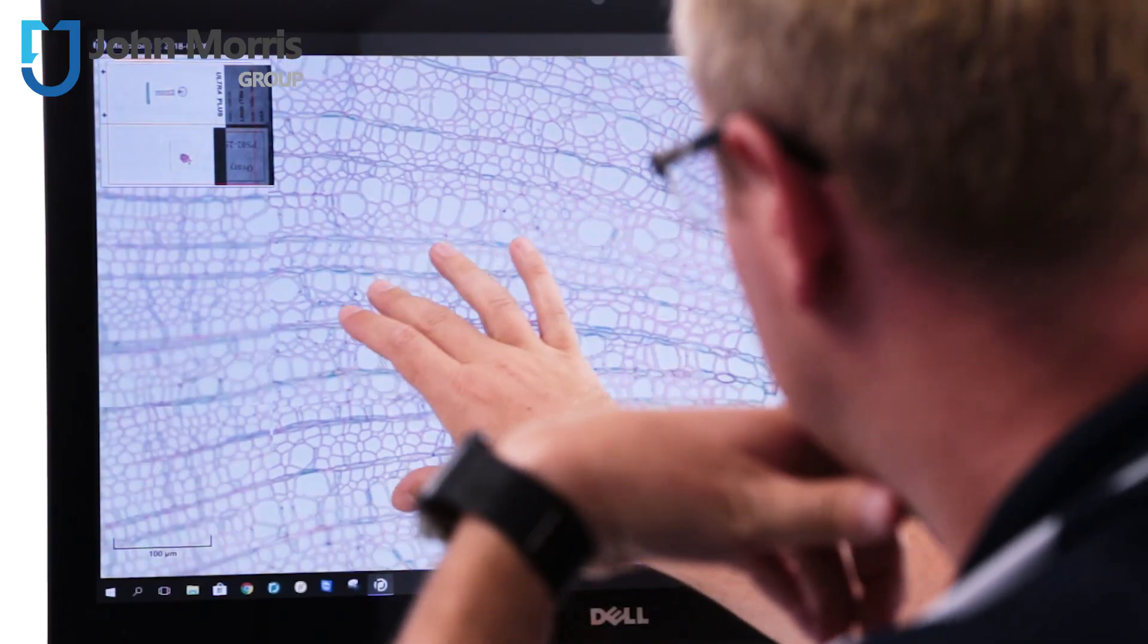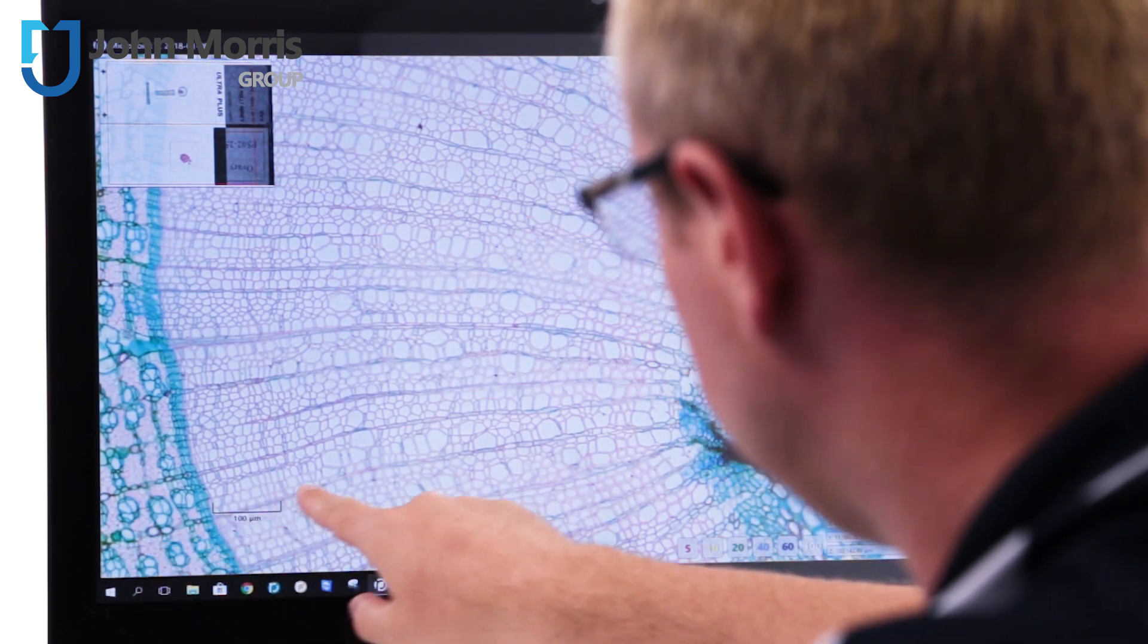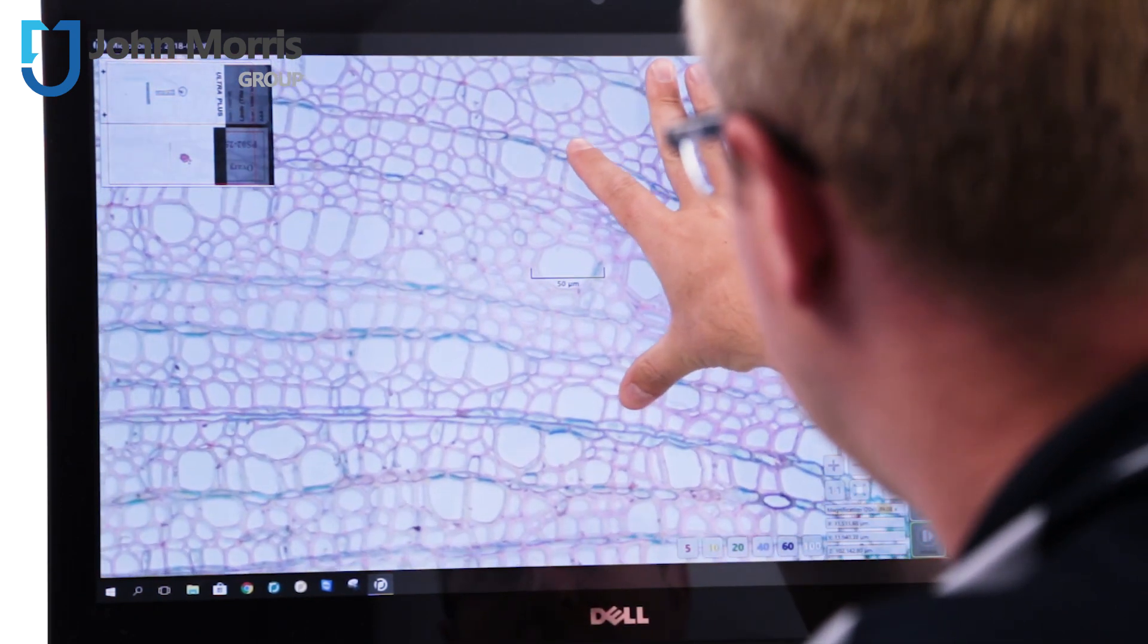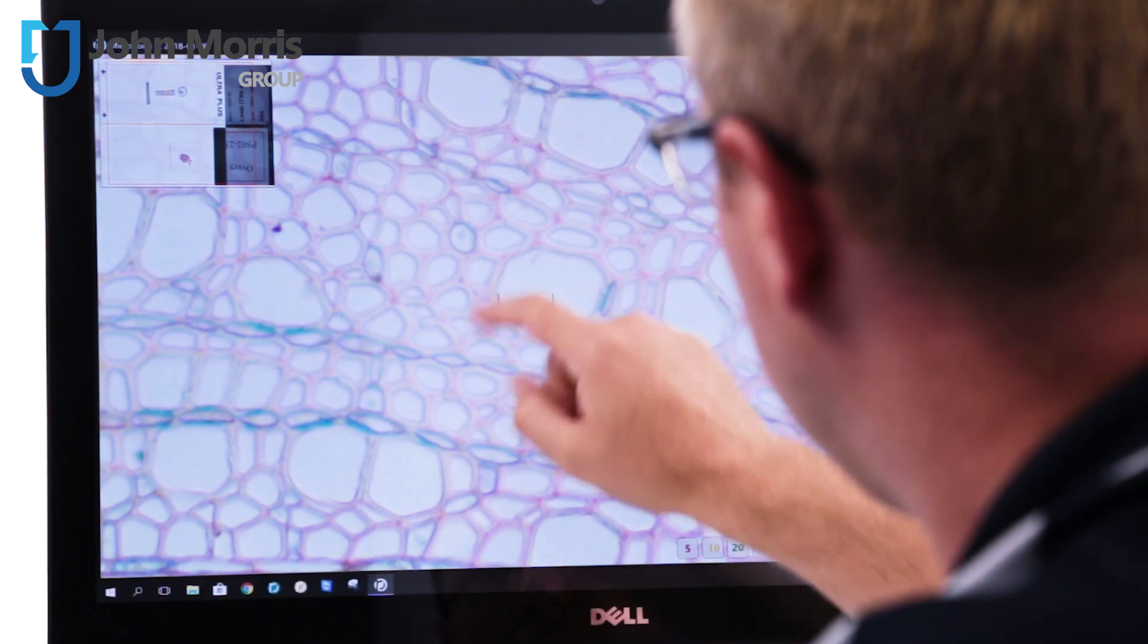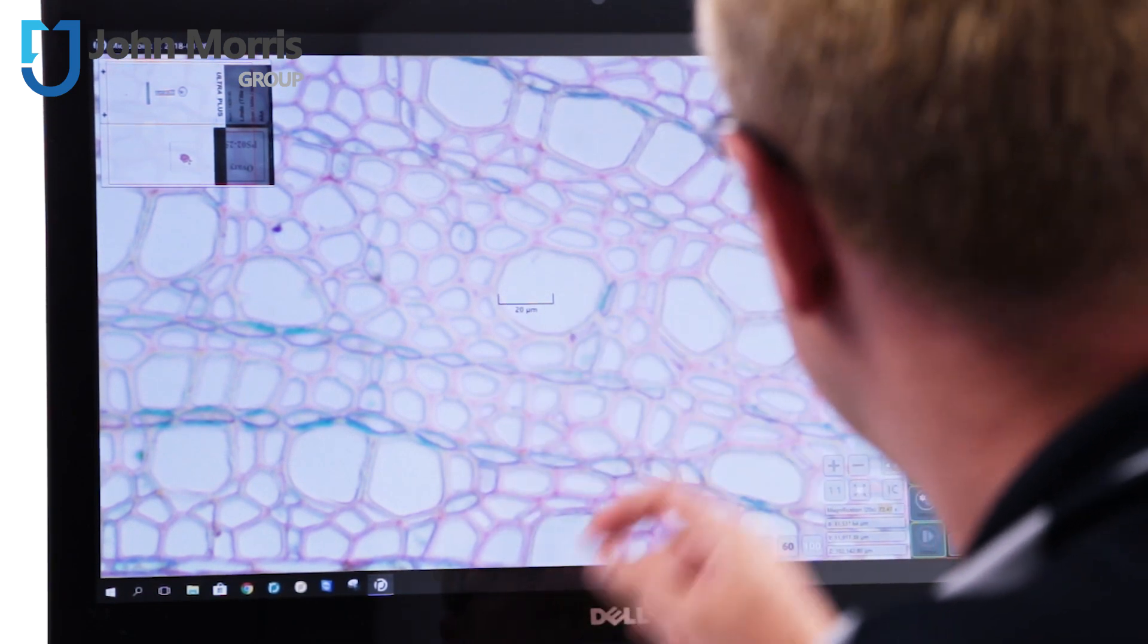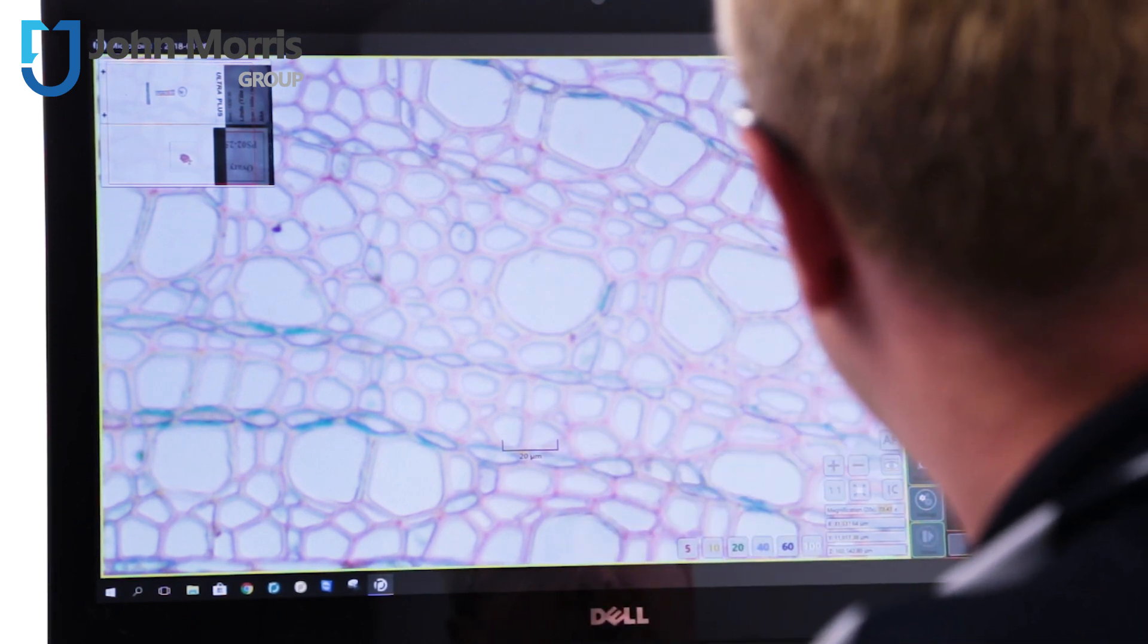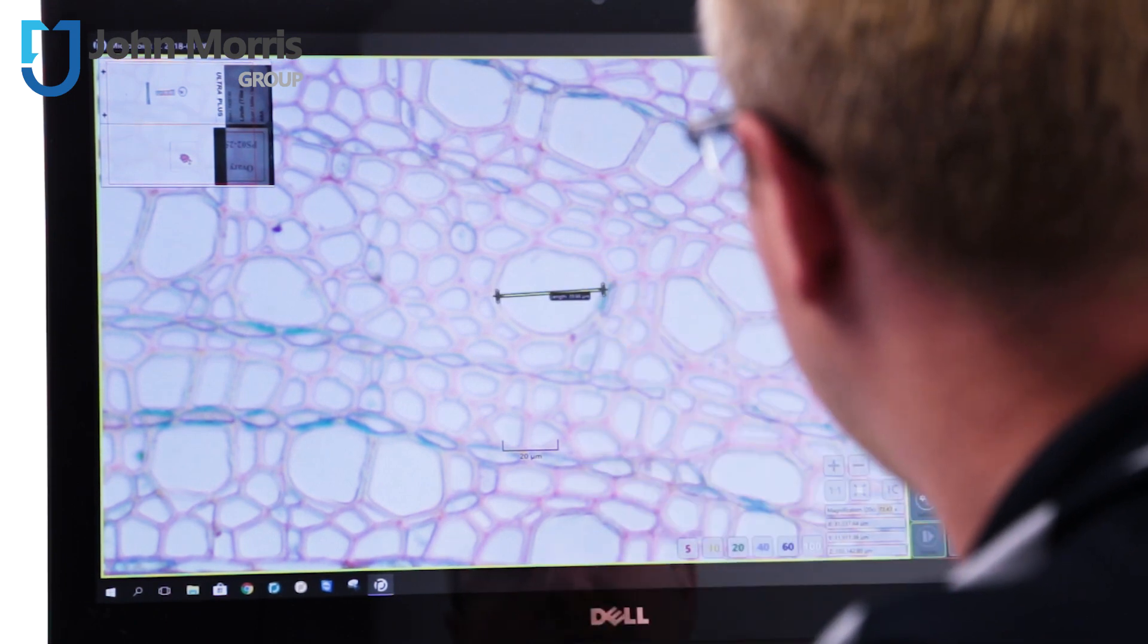So as we change our zoom here you'll notice there's a scale that's actually changing and that's really handy because you can slide that around and have a look at an object to get an understanding of its size. We've also got a number of tools there if that's not going to work for you. We can have a look and draw a line to have a look at the length of something.